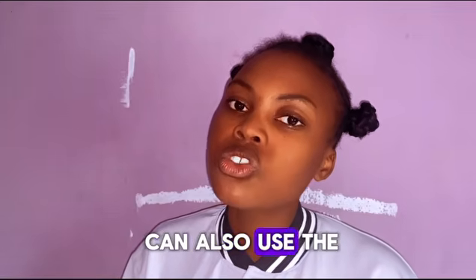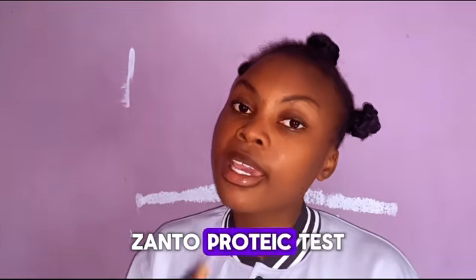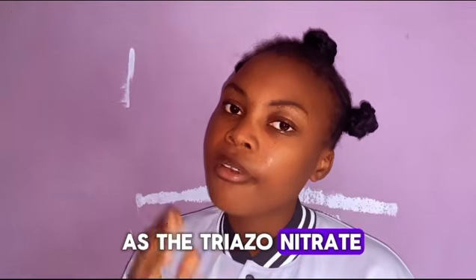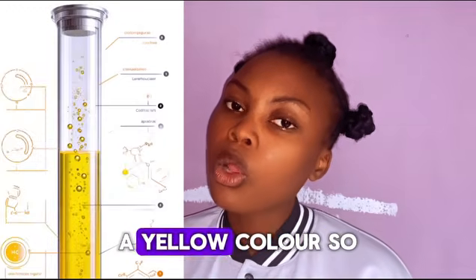You can also use the xanthoproteic test, which is also known as the concentrated nitric acid test. These tests give protein a yellow color.